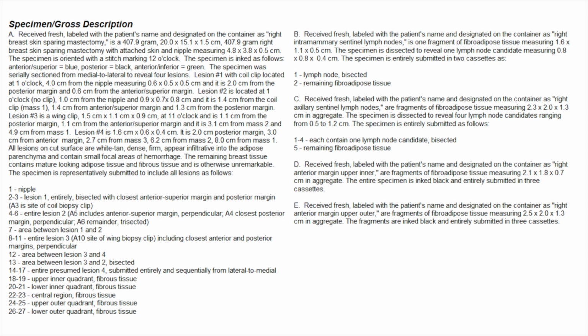Here is the final gross description for the specimen you are about to watch. It is here for your reference, and it will be shown again at the end of the video.